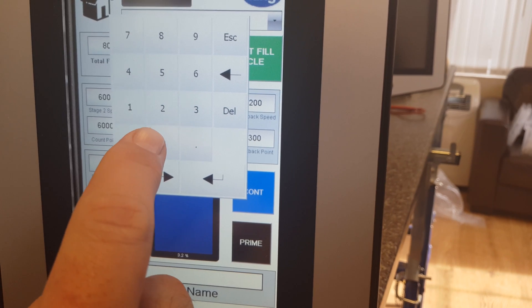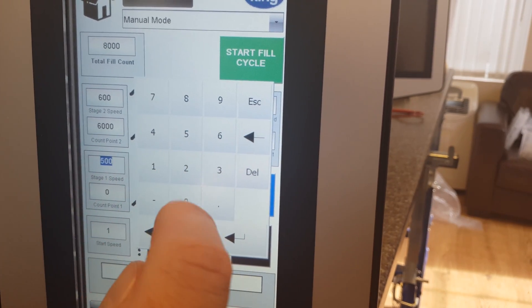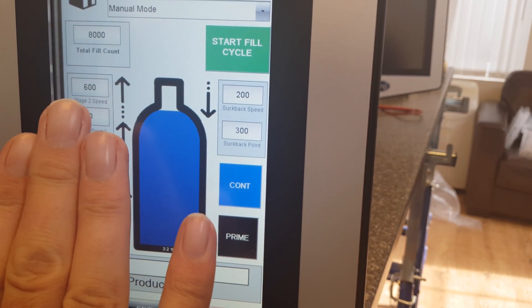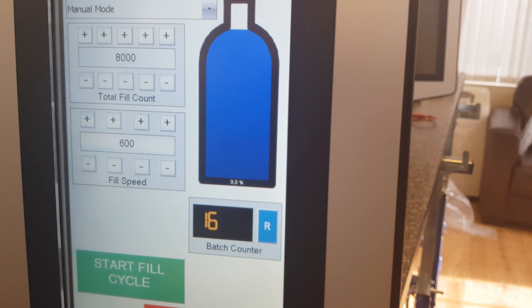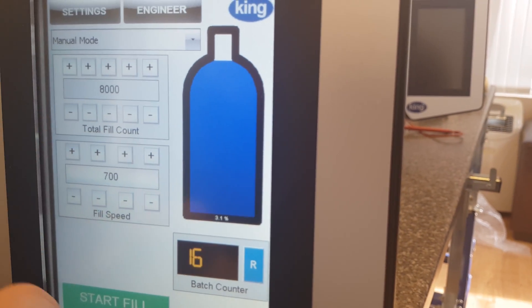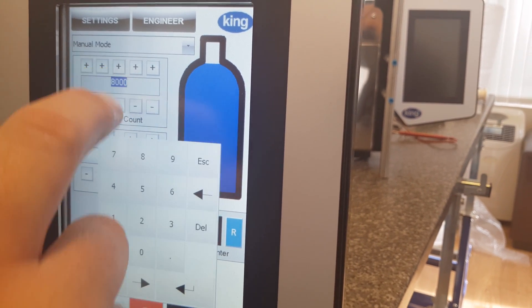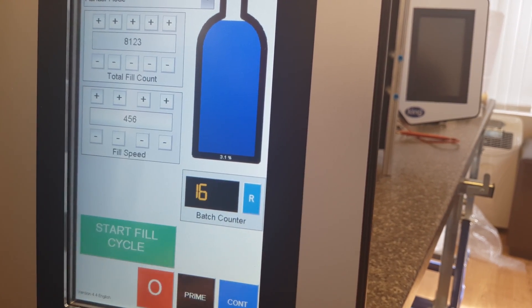We'll have the start speed as 1.0, and change that to 1, and change that to 0. So if you imagine these numbers aren't figuring in our profile fill — this number here is the total fill count, or the total number of times the pump rotates, which equals the amount of liquid dispensed and the speed of the pump. We can turn the pump speed up — say 700, 600, 590 — and it goes up to 1,500. This is the amount of liquid we want to dispense, so it might be a fill of 8,123 which equals a certain number of milliliters.